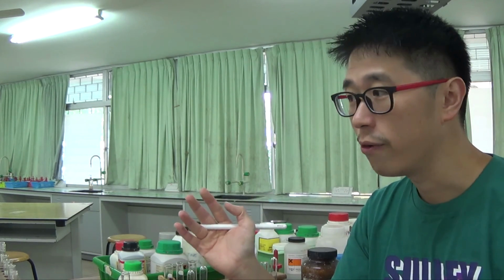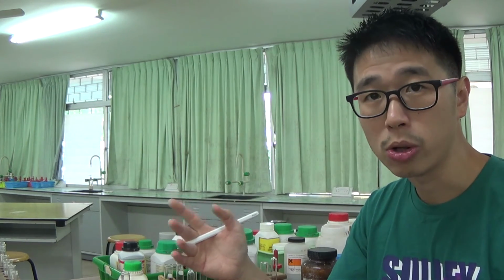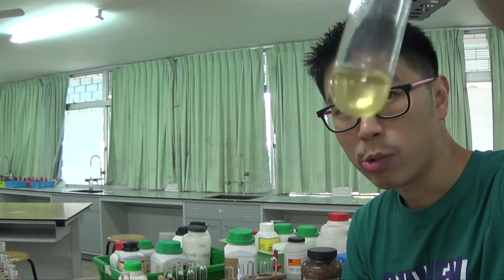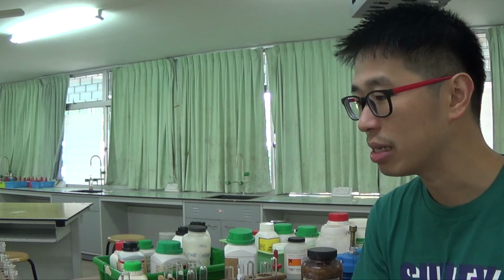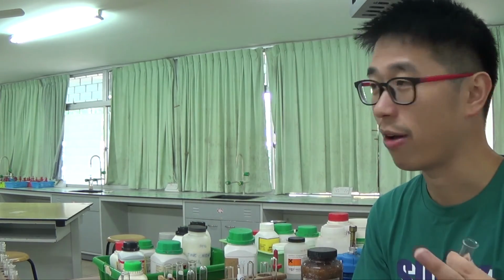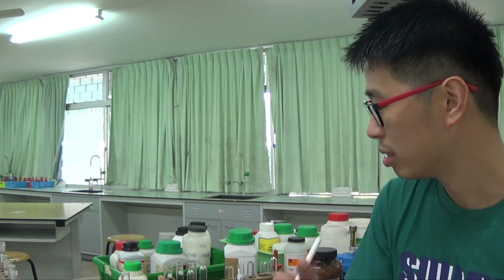You don't do a lot of transition metal chemistry in O-level or IGCSE, but this is actually very important in A-level chemistry. A lot of students get confused between what is solution and what is precipitate. Without the OH-, there is no reddish brown PPT. Iron 2+ is a very pale green solution in water, but in the presence of hydroxide, it gives you a dirty green precipitate, which you saw like 5 minutes ago. It's insoluble in excess ammonia. It's insoluble in excess sodium hydroxide as well.